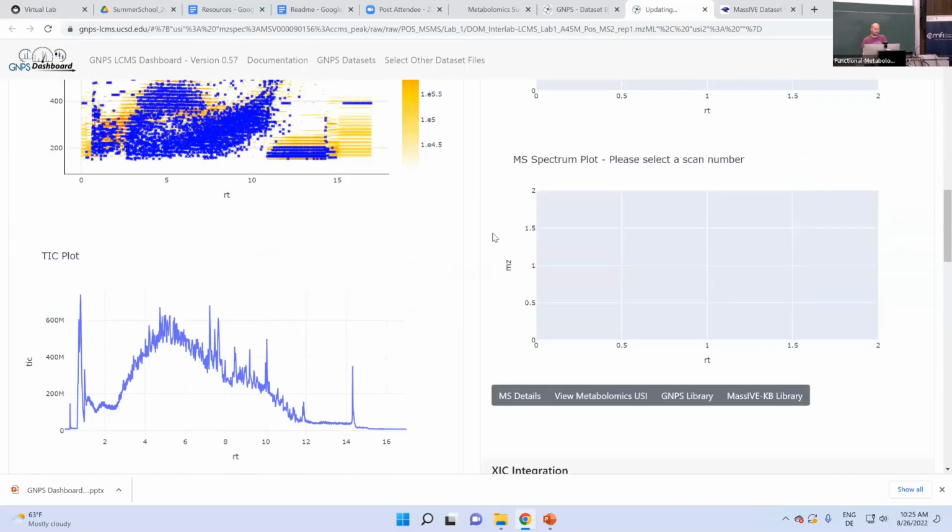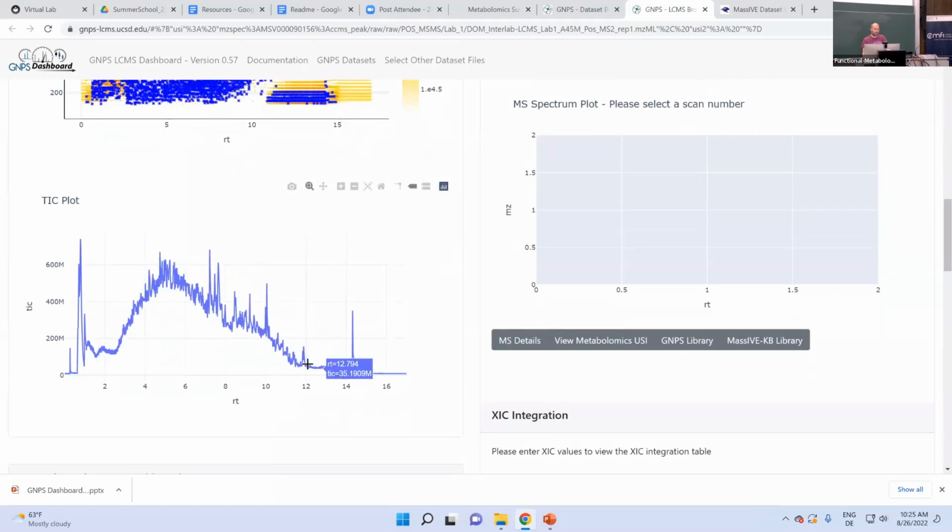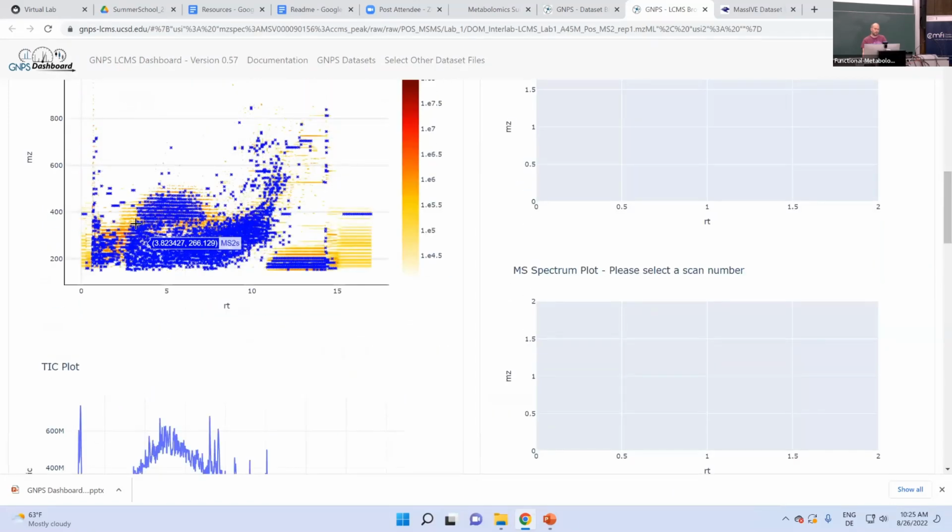And then when I go farther down, I see again here the TIC. So that would be basically the same information as this one. And now I can see already very nicely, right? There's kind of this island here in the middle, and there's a lot of MS/MS placed on it. Overall, I would say a pretty good distribution of MS/MS coverage, both over retention time and mass range, right? Whoever lab 1 was, I think Allegra, I think that they did a good job with setting this up.